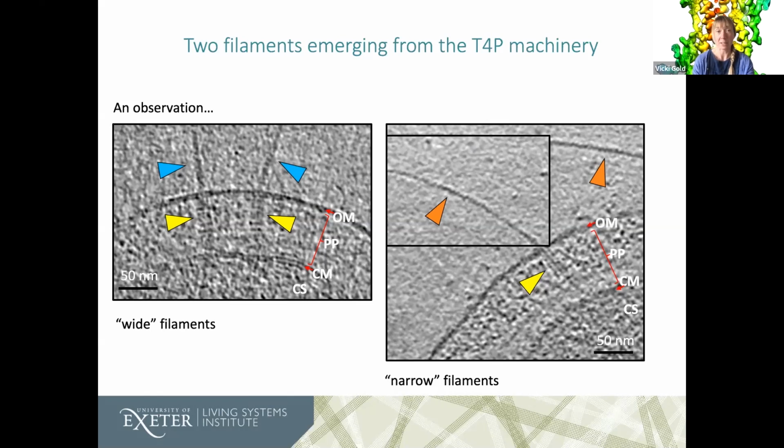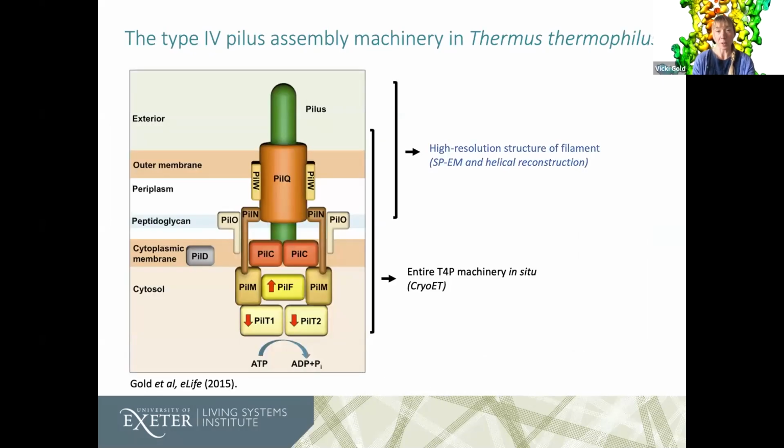It's very hard to see differences by cryo-electron tomography. It's not super high resolution. So in the next part of the talk, I'm going to talk to you about high resolution structures of the filament, which are based on single particle electron microscopy and helical reconstruction.